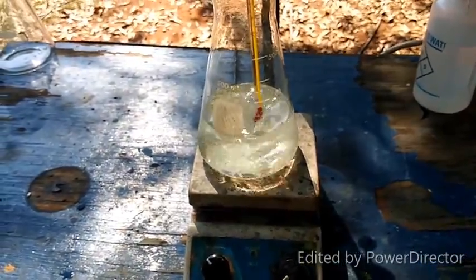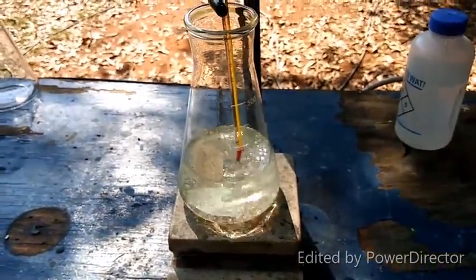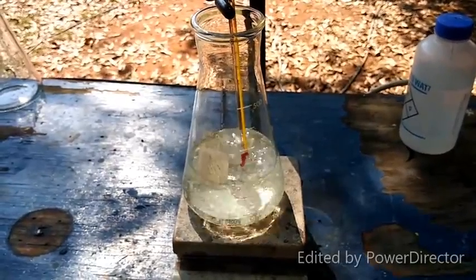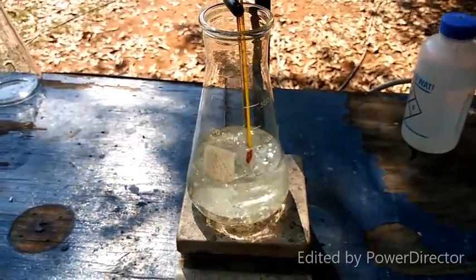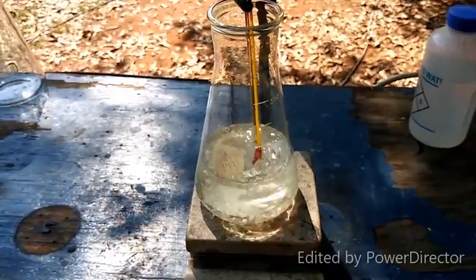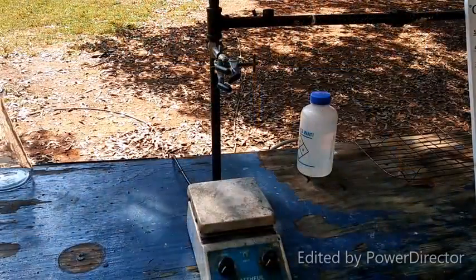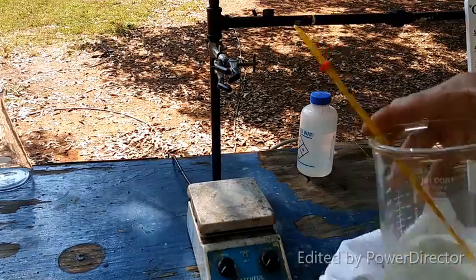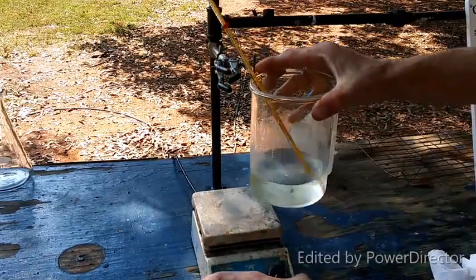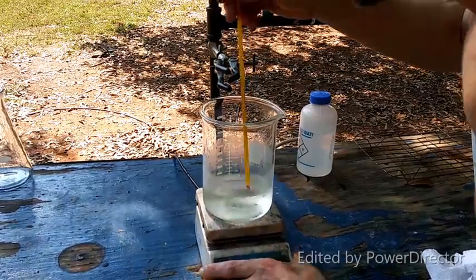And then once that's at the right temperature, we will combine the hypochlorite with our solution of phthalimide, and that should generate sodium anthranilate. So, again, fingers crossed, people. Let's hope it works this time. Alright, our phthalimide solution is down to just under 10 degrees C. It's about 8 C.